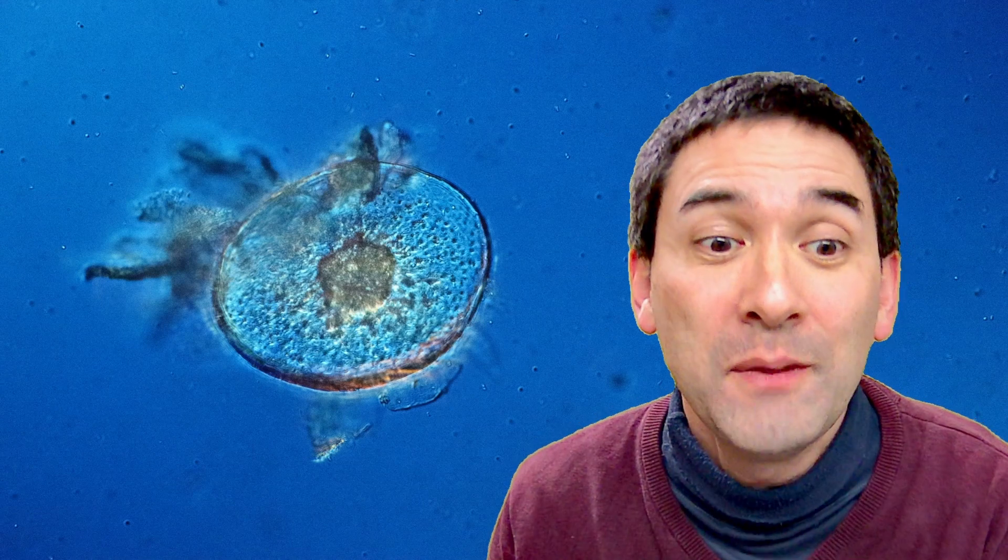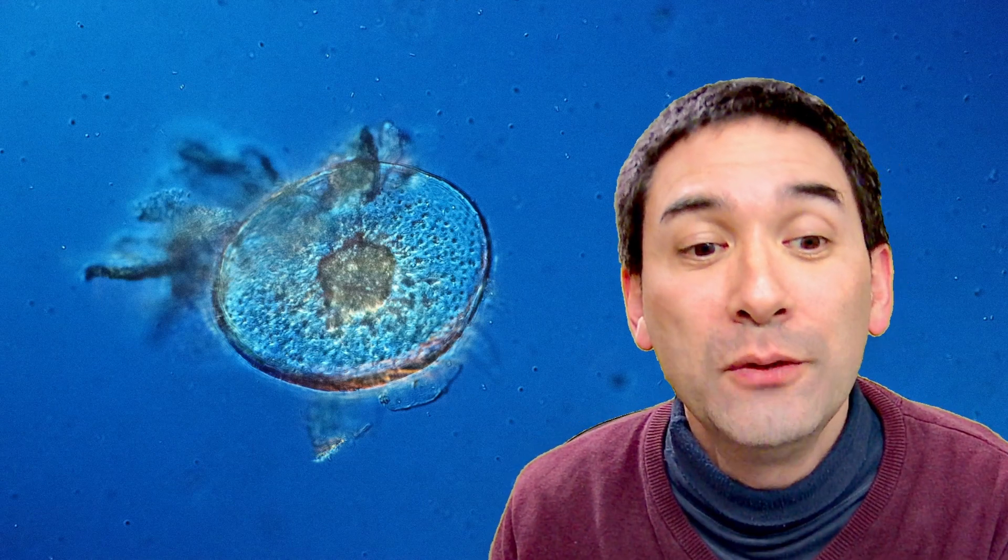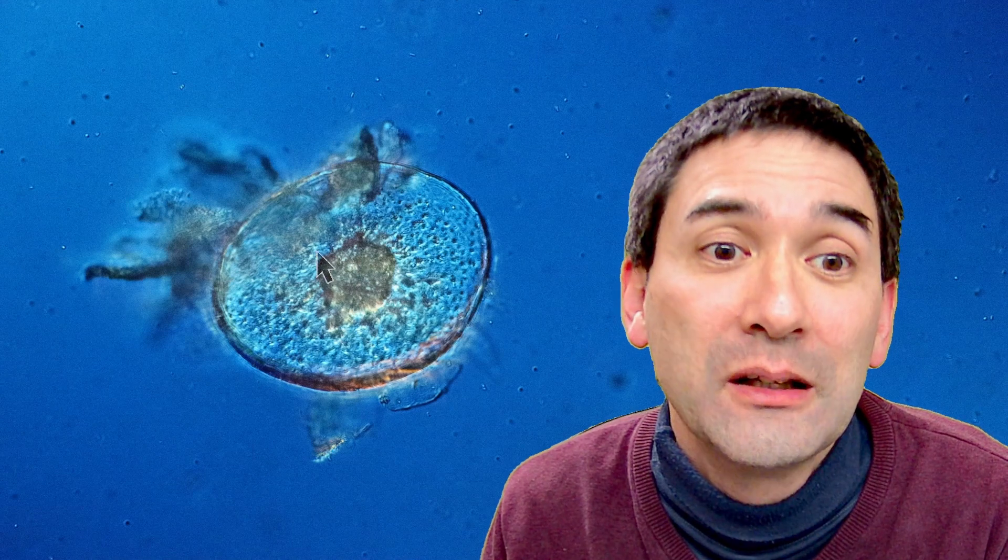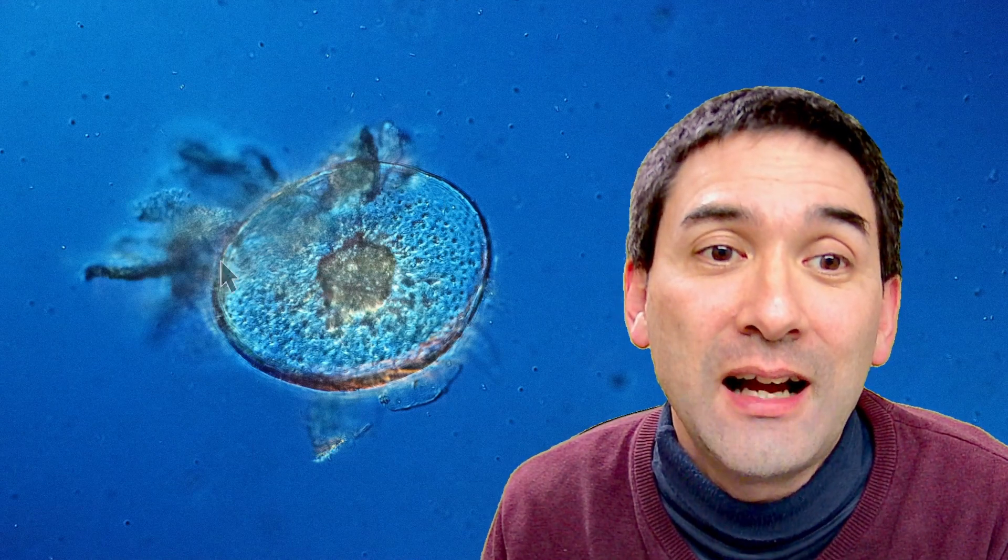But this here is not a skin cell. This is actually the cross section of one of my hair. And you can see quite beautifully over here that there are different layers in the hair. So this is the cross section over here. And you see the center over here is a little bit different than the outside here.